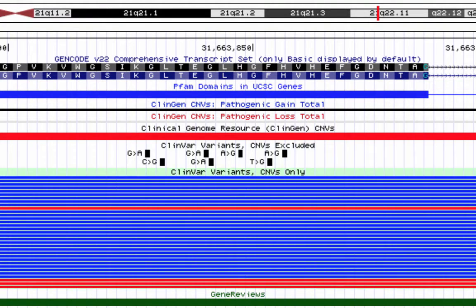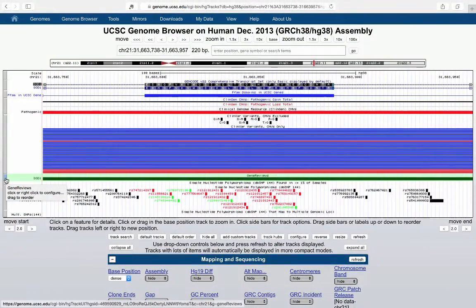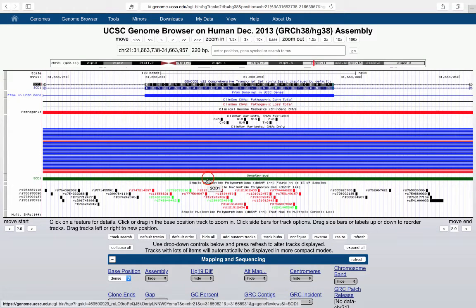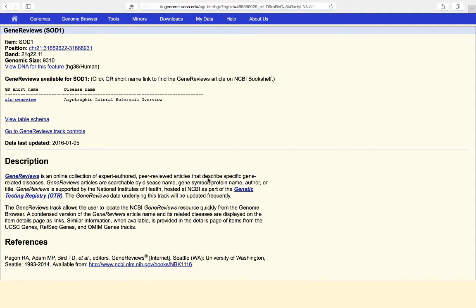Finally, I want to look at the Gene Reviews track — I turned this one on as well, and it is not on by default. It's very useful because if you want to learn more about your gene of interest, you can click through on Gene Reviews. If there is a review for that gene, it is available here. In this case, it's an ALS overview.